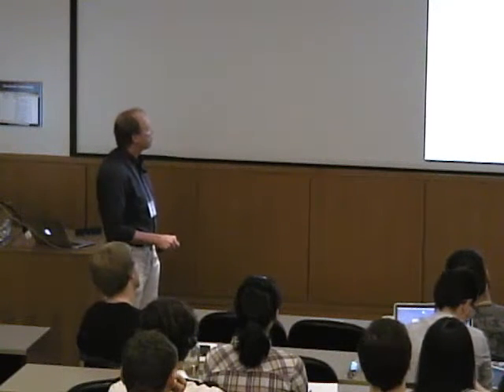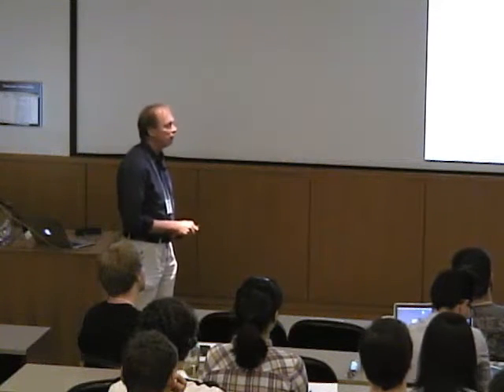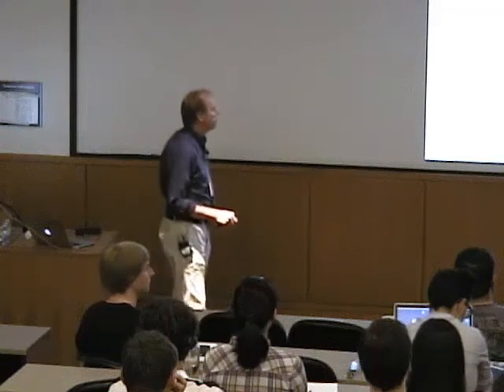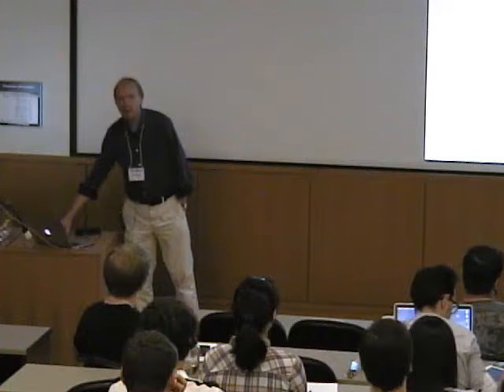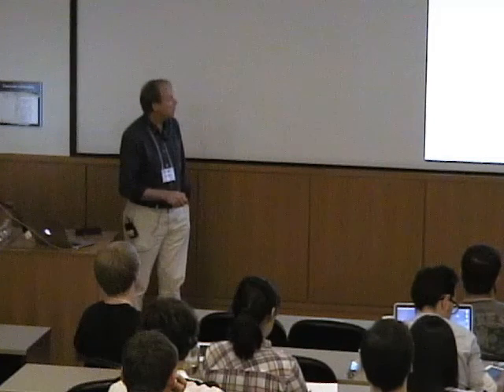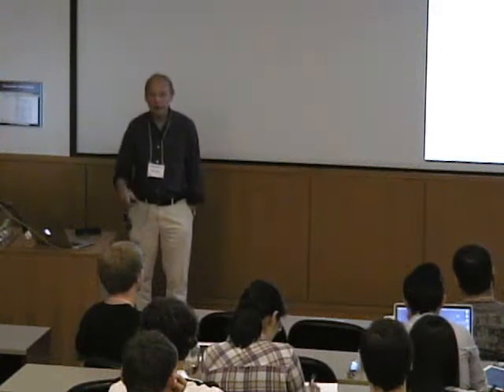The problem here is that the absorbance is very, very weak, right? And so we run into technical problems trying to measure the absorbance in this way, right? There are a few exotic, very high magnetic field instruments where the absorbance is measured, but in general in EPR we can't do the experiment in this way. And the problem really is the question of sensitivity. So the absorption is very small, and so it's really, really difficult to see the small changes this way. And we have to resort to other methods to improve that.